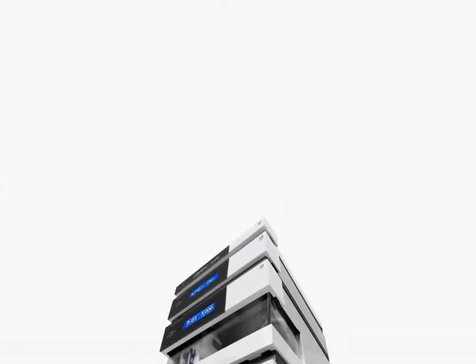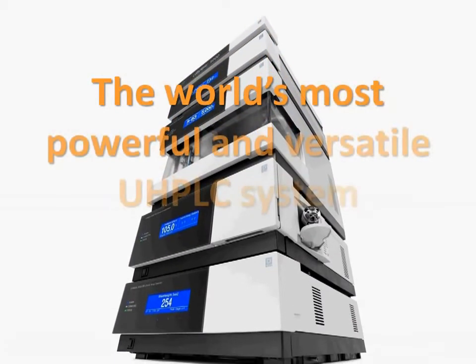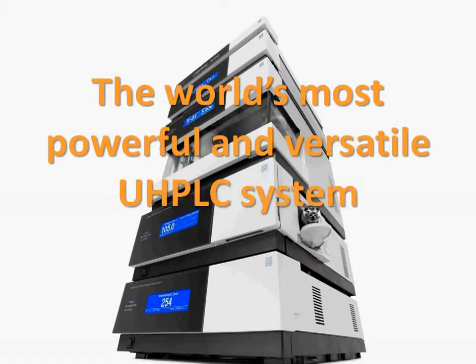This is the new Ultimate 3000 RSLC system, the world's most powerful and versatile UHPLC system.